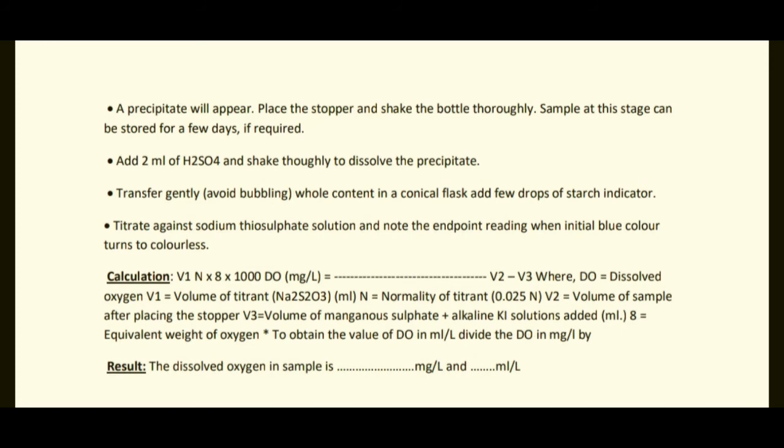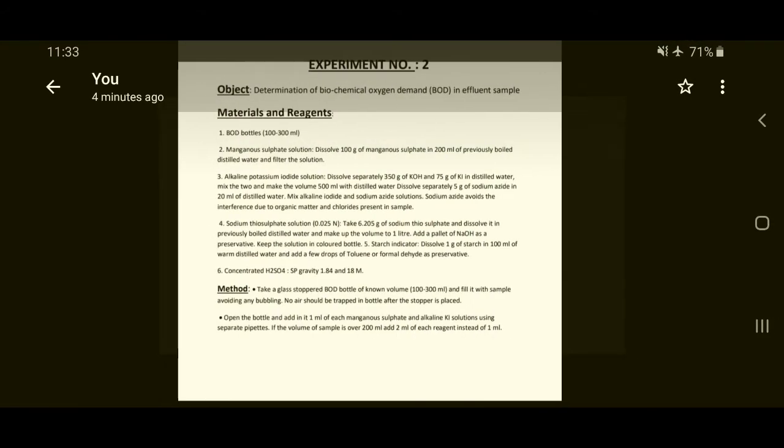The results for the given sample are given below. Okay students, so this is the determination of biochemical oxygen demand, BOD.